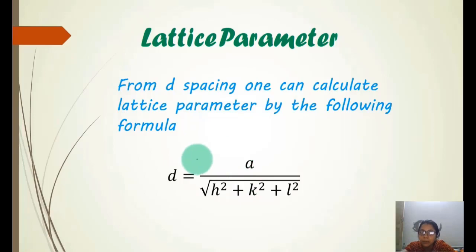By comparing the interplanar spacing, peak positions and intensity with the standard diffraction data of all the samples, you can know about the interplanar spacing.